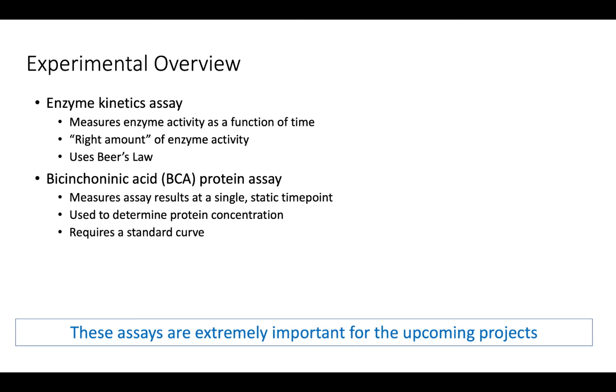It is used to determine protein concentration. So, powerful assay that way. The caveat, and I'll mention it again, is that it really doesn't measure a specific protein, but it measures all the protein that you would have in a sample. So great assay for measuring protein concentration, but not specific.